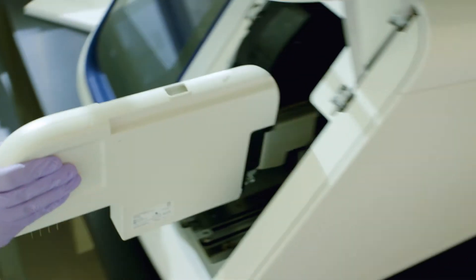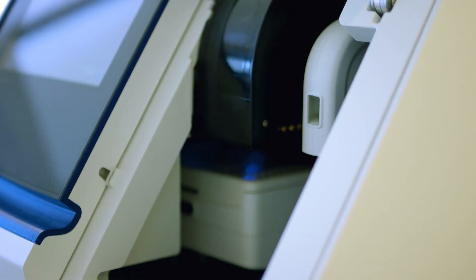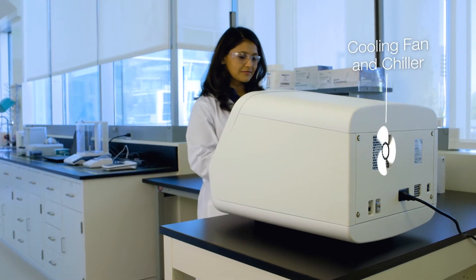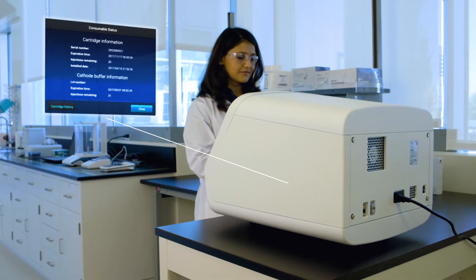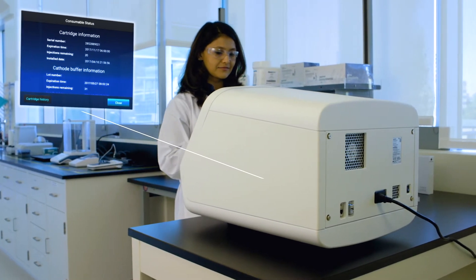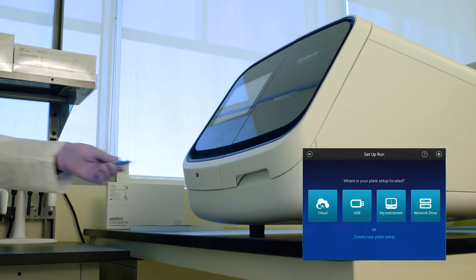One simple step with no fussy capillaries — it clicks right in. An onboard cooling fan helps reagents last up to six months. All SeqStudio consumables have RFID tags, so tracking is automated and easy.